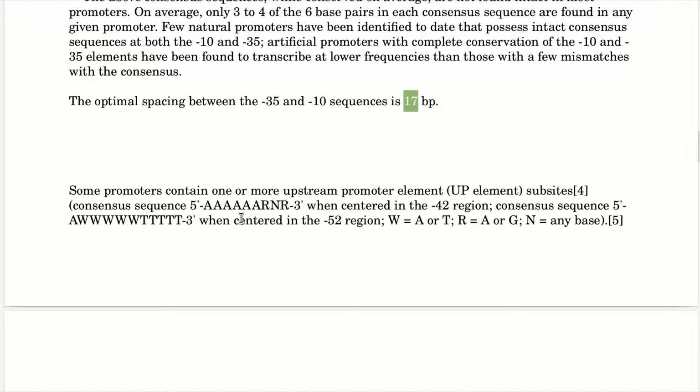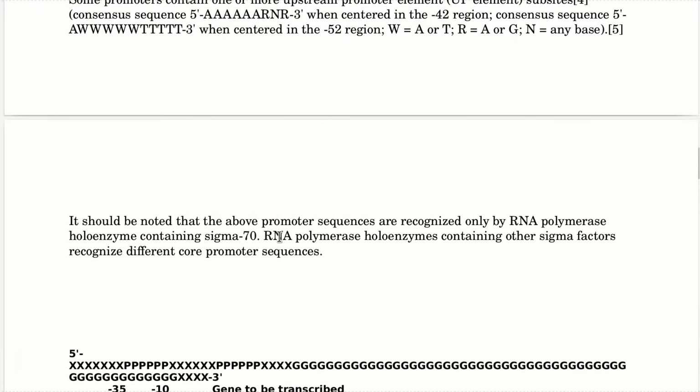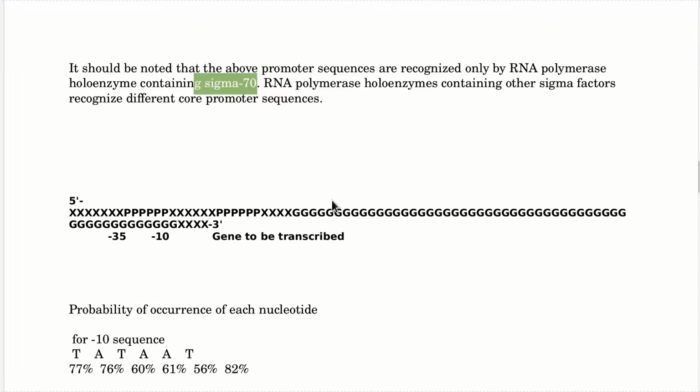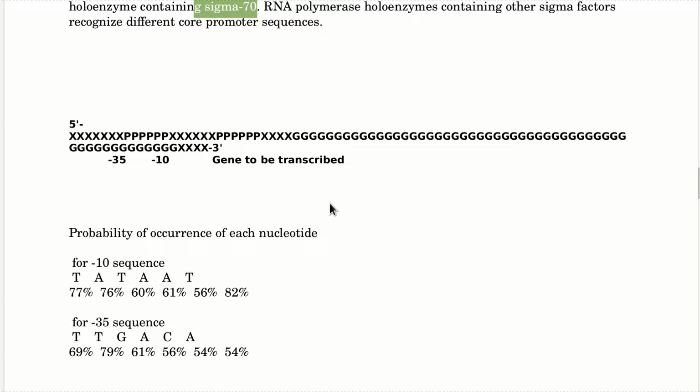Those are more of how a bacteria regulates its genes. We use transcription factors, all right? And the UP element is similar to a transcription factor, so look for it. Here are your letters that you can look for it, and your locations. So this is just an extra sequence. Let's see, the sigma 70, you may have learned about that in molecular. But basically what we're looking for is something like this. So here is your gene to be transcribed. Here would be your -10 and your -35.